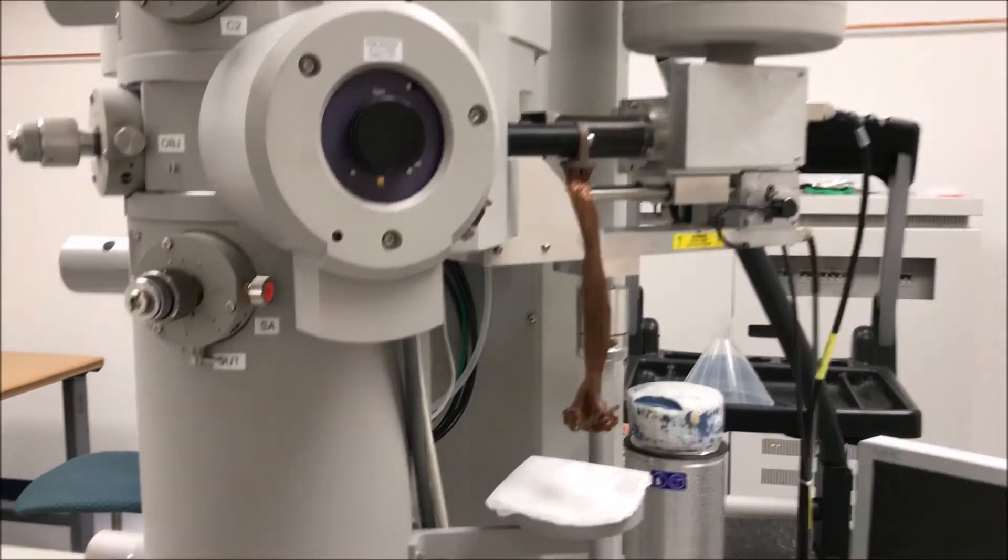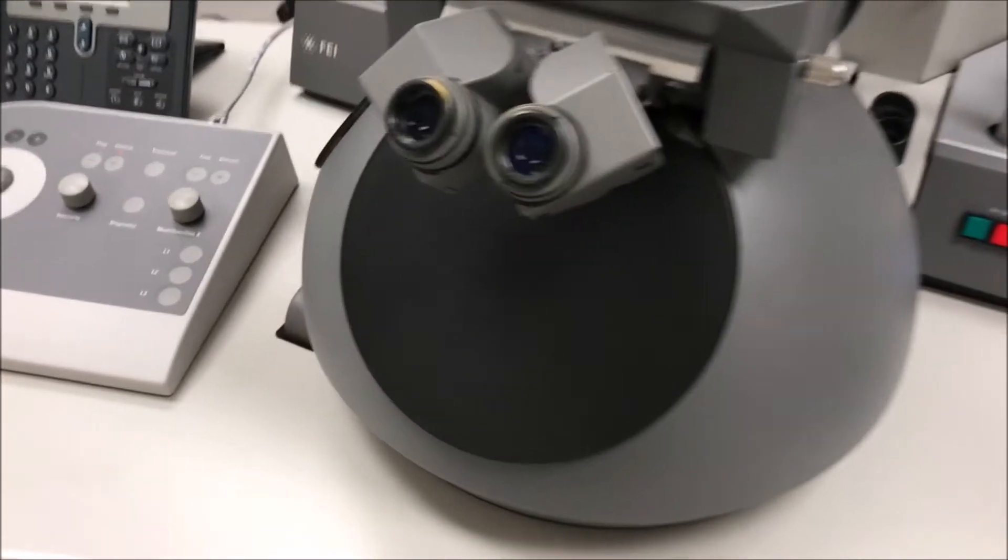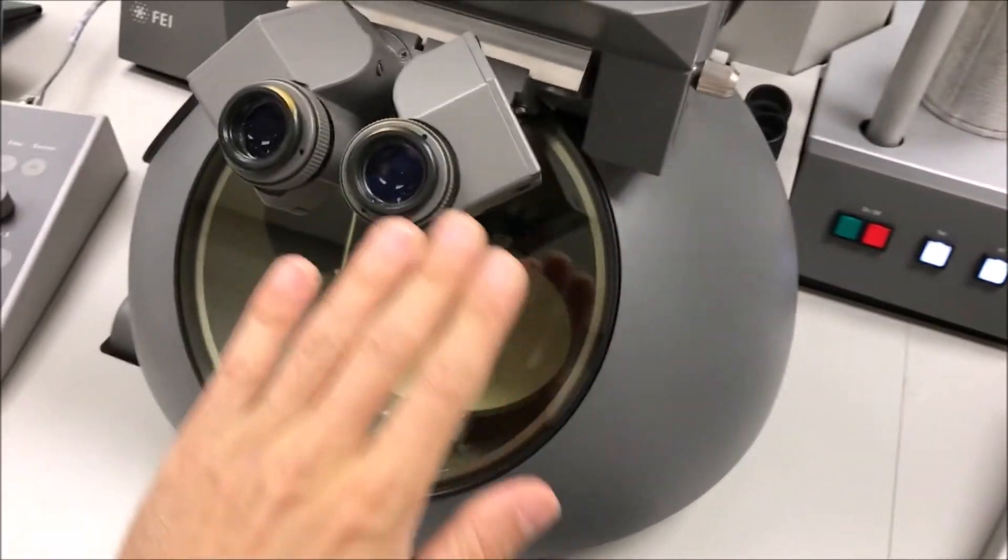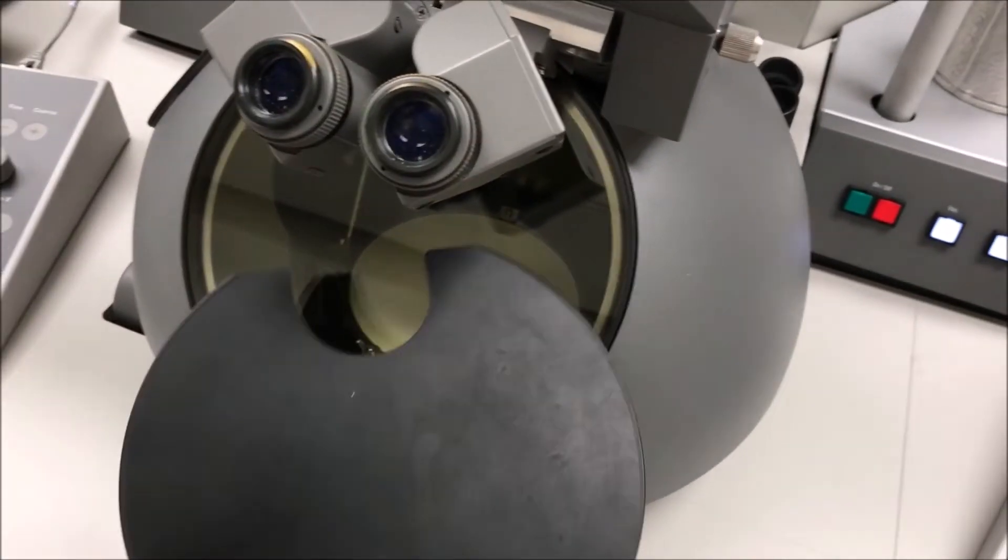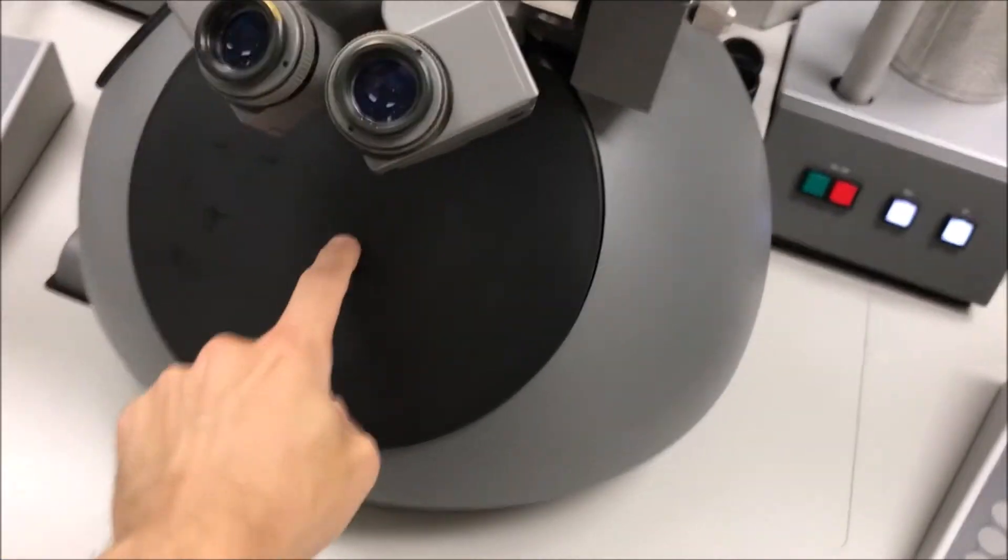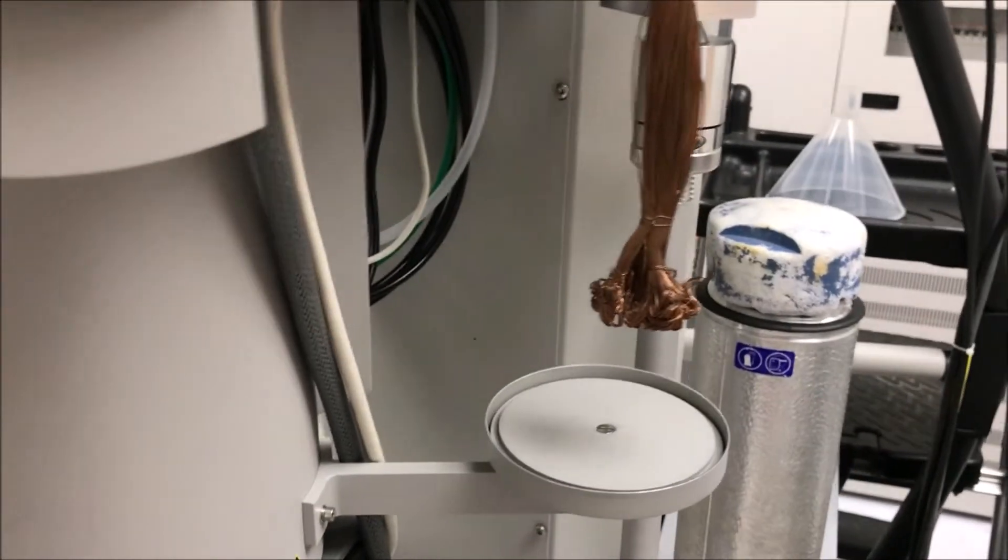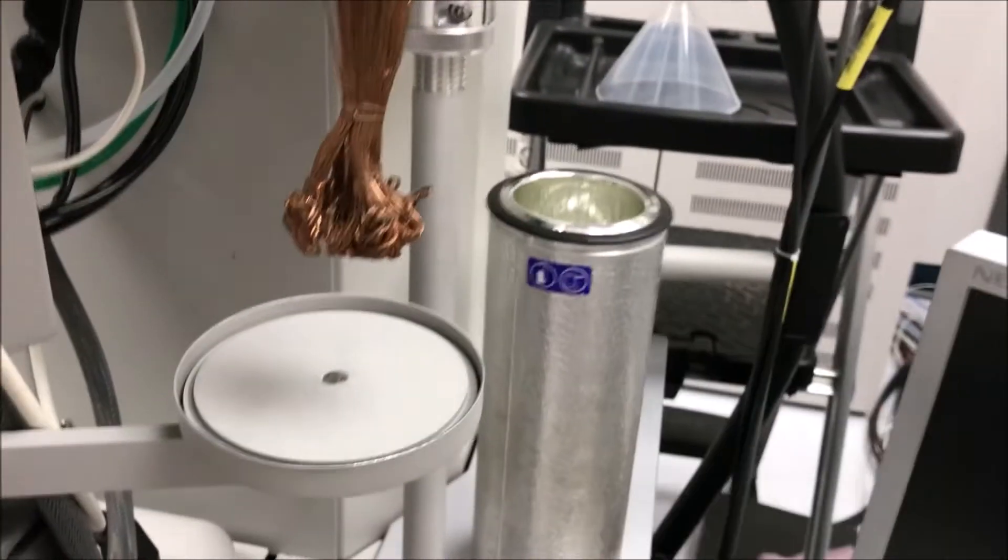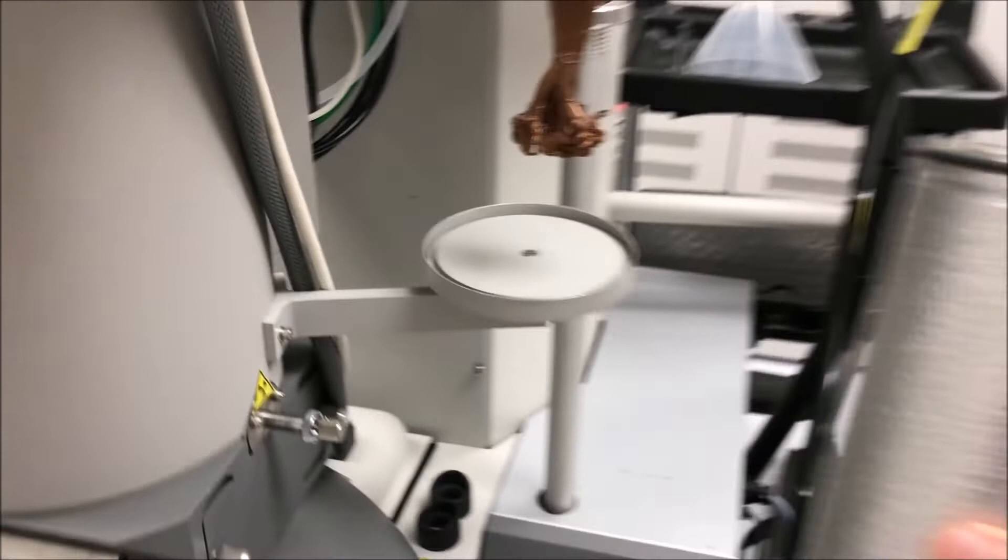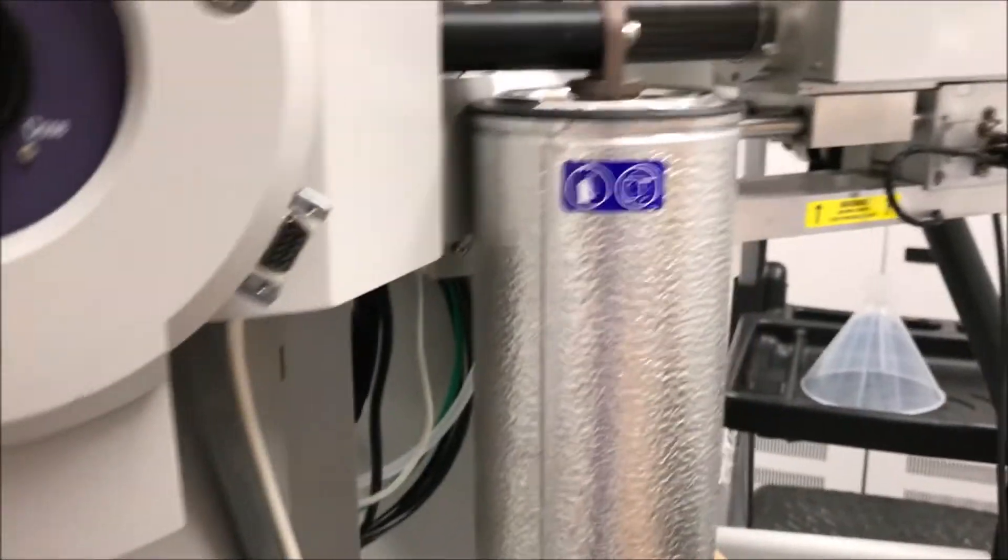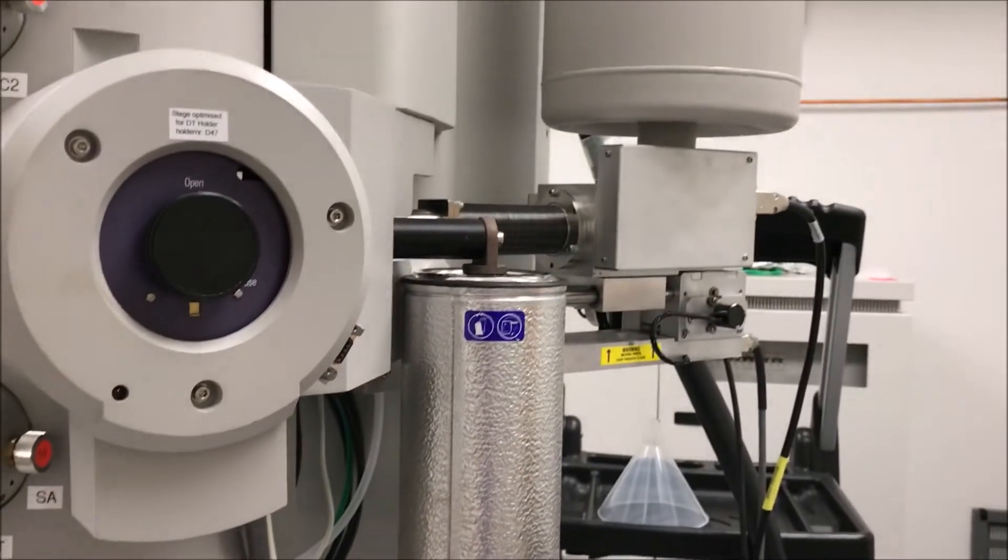The first thing to keep in mind is to make sure your viewing screen is covered with its plastic or rubber cover. You don't want to leave the screen uncovered because if you spill liquid nitrogen onto it, you could cause it to crack, which would be a very expensive repair. Make sure the support base for the canister is clear, then stick the copper braids inside the canister and put the canister onto the support base.